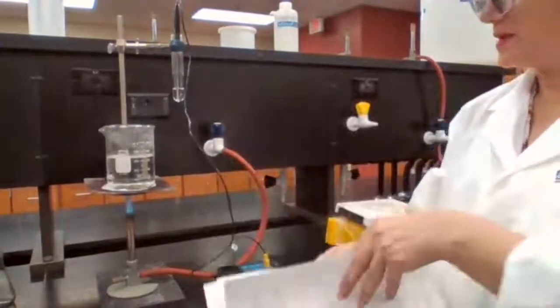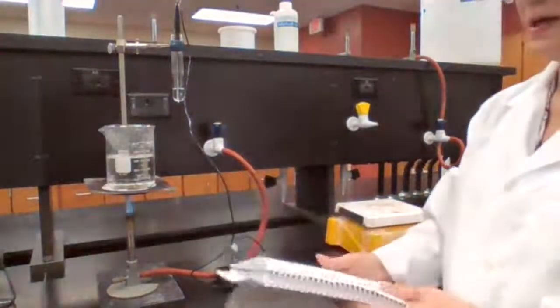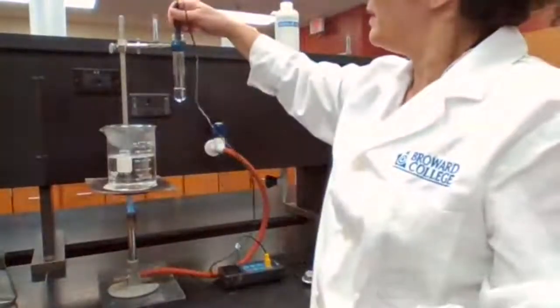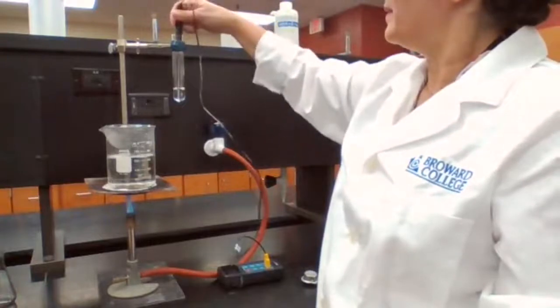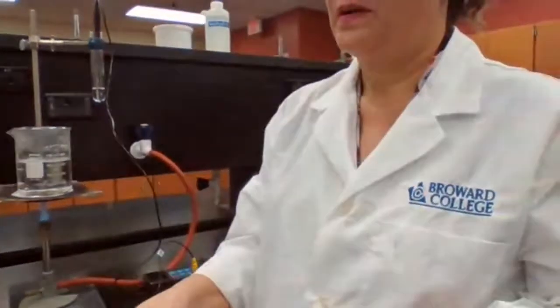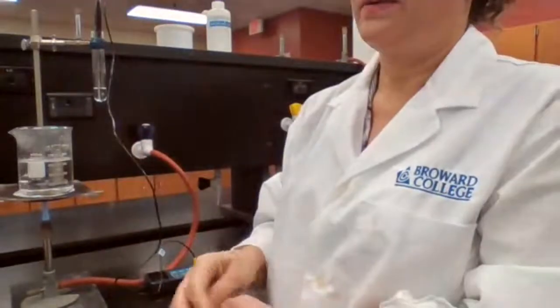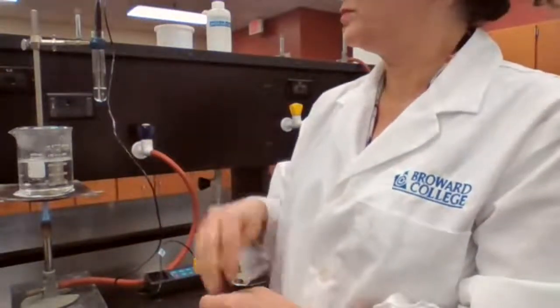So we have to let it cool down, and occasionally I'm going to stir it to make sure that it cools evenly, and we are going to wait for it to freeze.